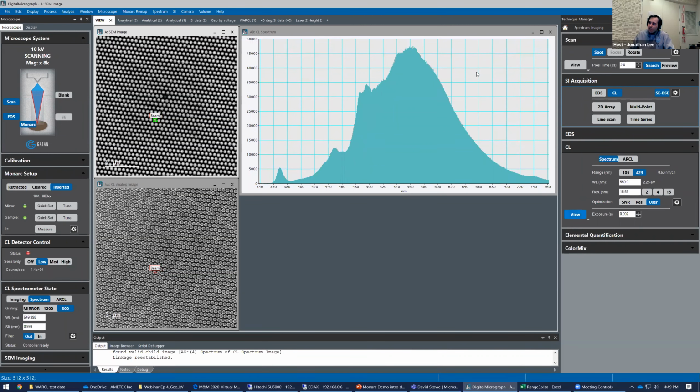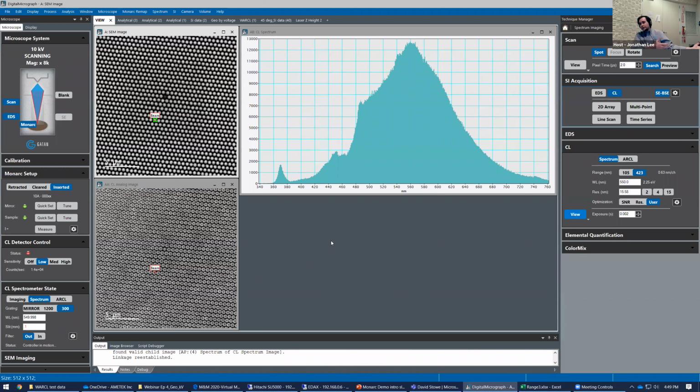So then what happens when we shrink that slit size? We'll go to 0.1. And again, this is all automated. There are no knobs to turn. There's no manual interface. I don't have to push any buttons or punch anything in. It's all at the GMS interface level. So you can see the spectrum has effectively changed from what it was.